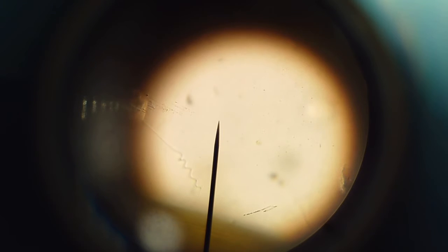These guys are really behaving well, this is the way they should be. There he springs back, he extends out. Let's see if I can get him in focus a little better.